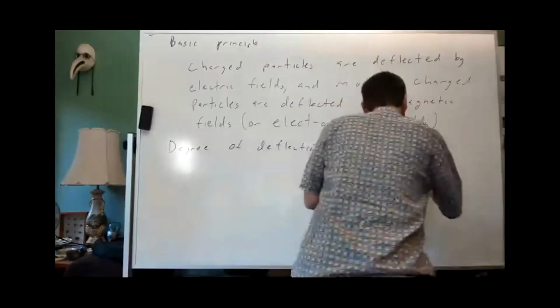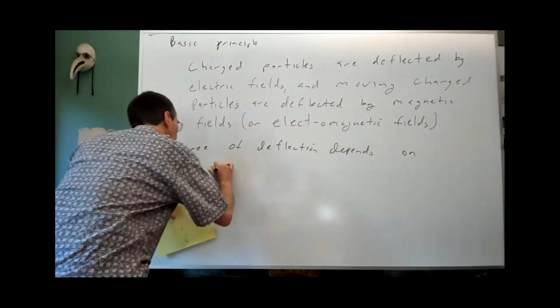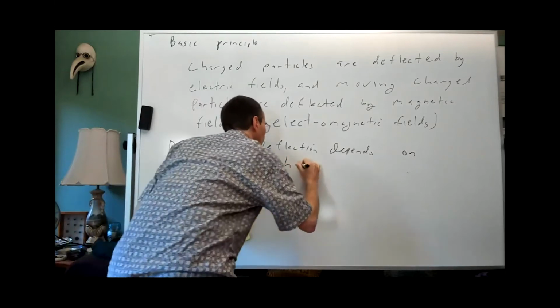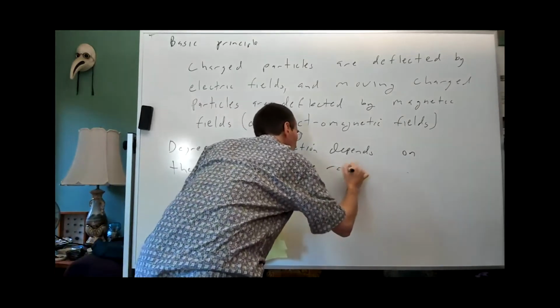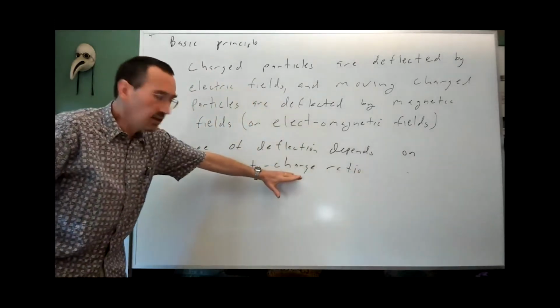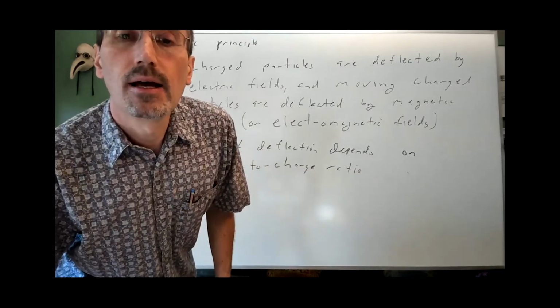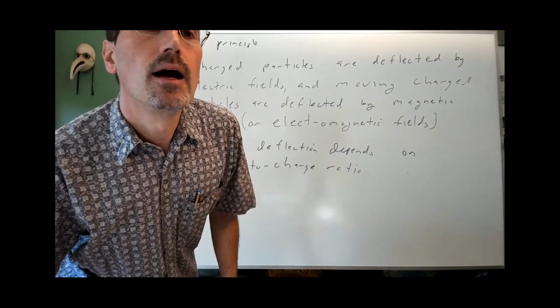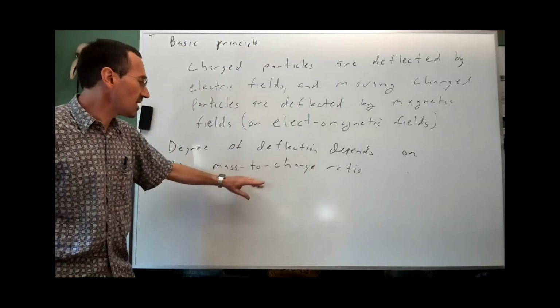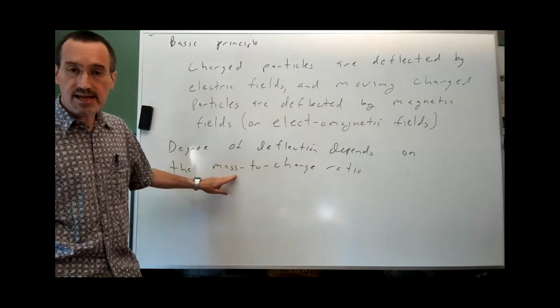On the mass to charge ratio. And again, I'm going to put a little bit of emphasis on this, because it's not simply the mass that you're looking at.